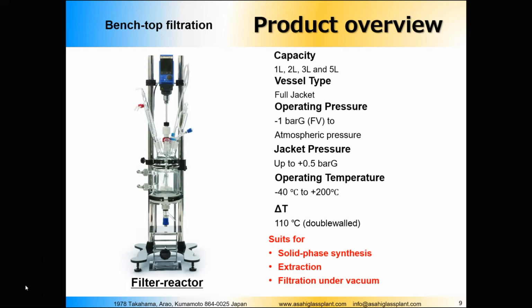I'm not sure if that's the right word, but the crystals will be formed inside the filter, which will obviously lead to no filtration at all. And if we're talking about filtration with a solid catalyst, then the catalyst will again be only above the filter, and below the filter, where we also have the reaction mixture, there will be no catalyst. It means that there will be no reaction below the filter. So again, you will have some problems.